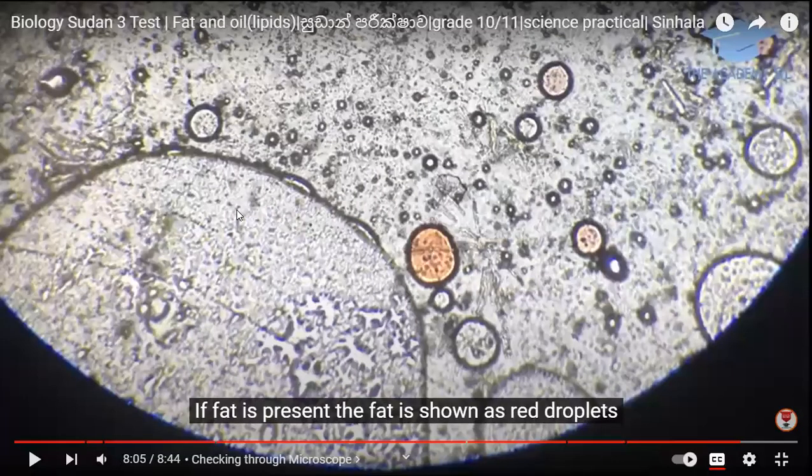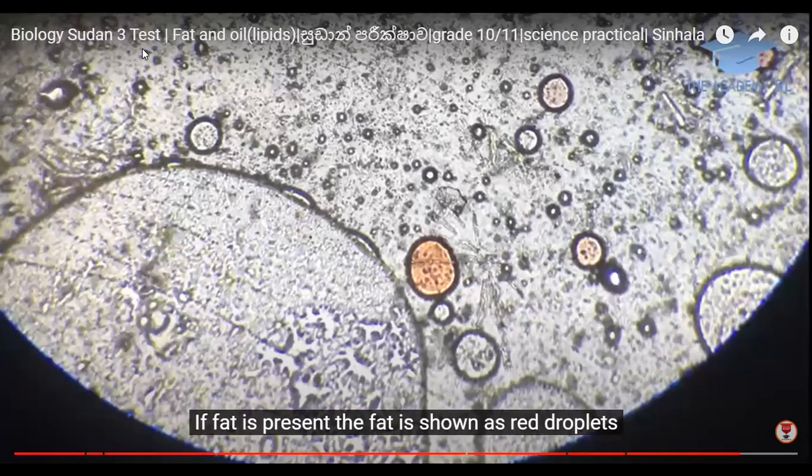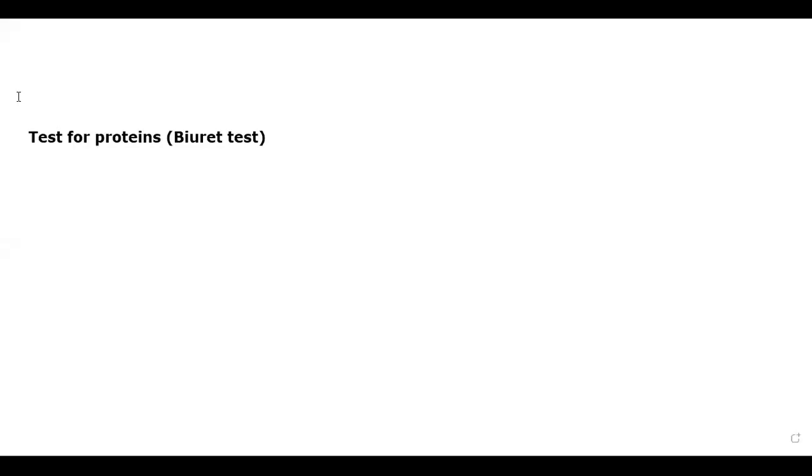This is how that photograph looks. Can you see the pink color? Circular components? Yes, sir. They are the lipid droplets.